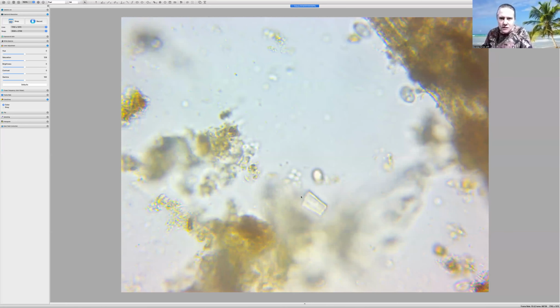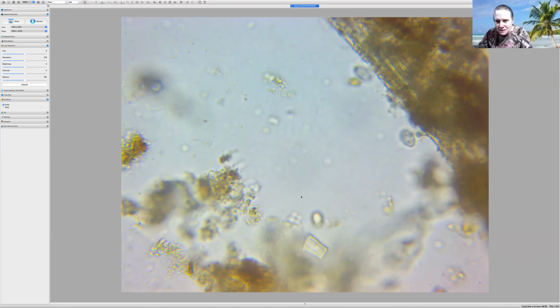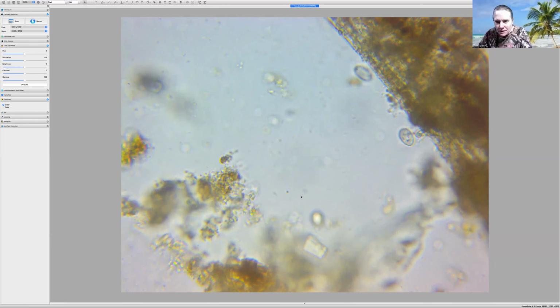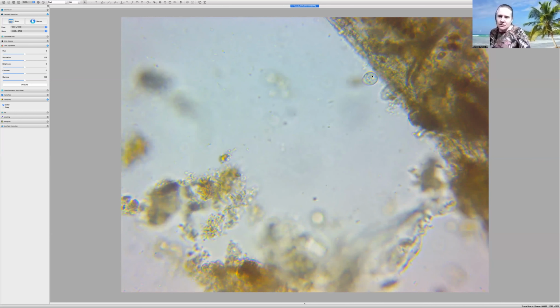Because you can see this vortex. Flagellates are flying everywhere. Okay. So, nope, we're too high up. There's testate amoebae though. Let's see who's creating that. There, she just zapped. She caught something. Now this is a ciliate below here. Okay, see that movement? That's a ciliate. Okay, she's going to take off. This one here is not going to take off because she is attached right here. And she's just got this vortex going on.